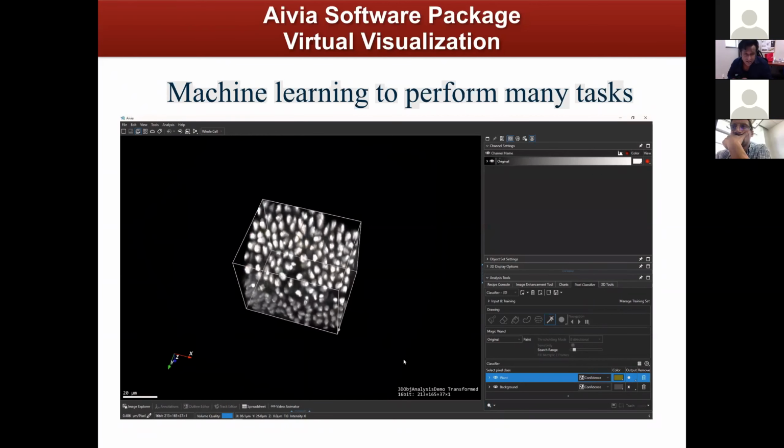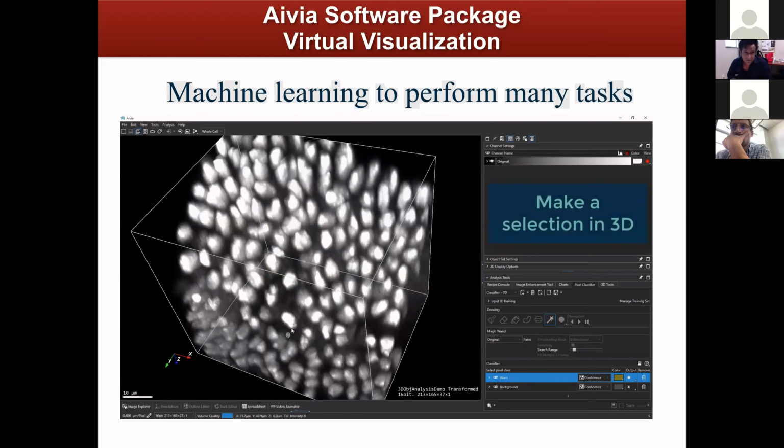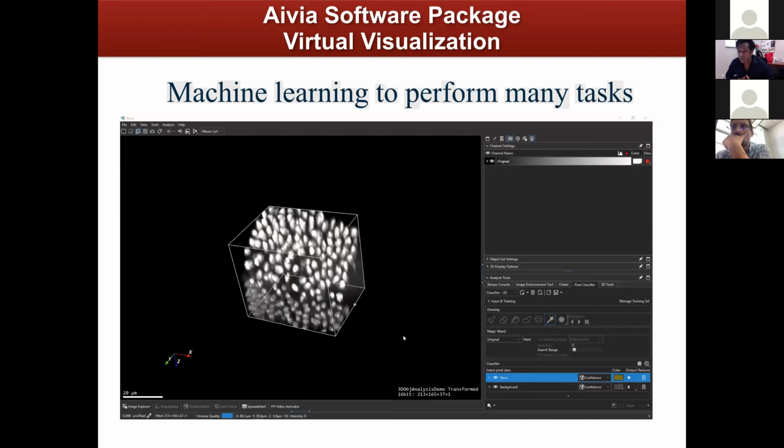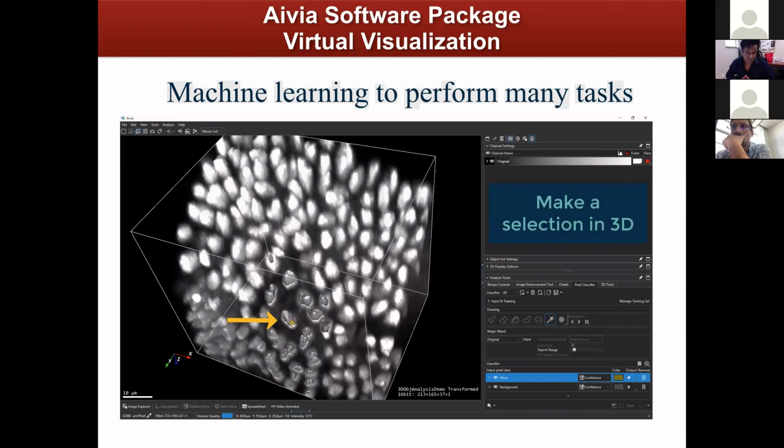There is a question from Bilal. Can we obtain information about the roughness, RMS surface, with reconstructed 3D images? Well, to an extent, yes, Bilal. When you say roughness, you have to have a scale to compare it. If you have one sample and you want to measure the roughness of that sample, the RMS or the surface area with respect to some other standard sample, you can do that, but you need to have that information. Does that answer your question?